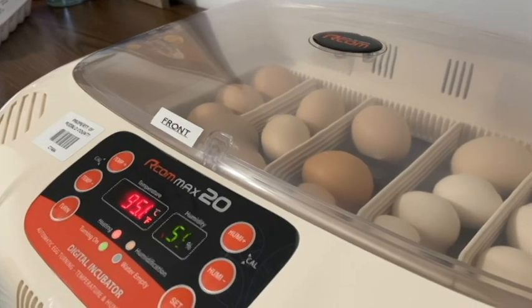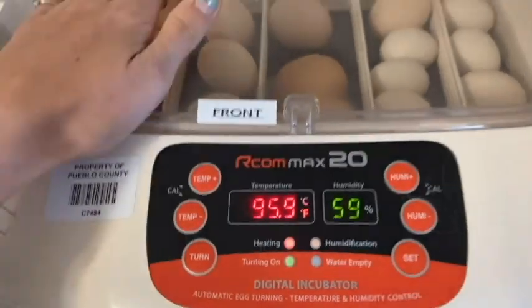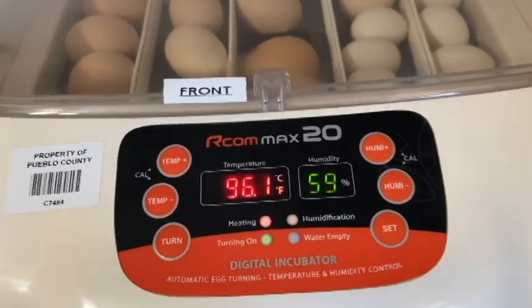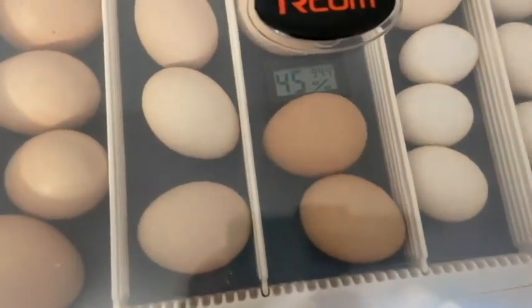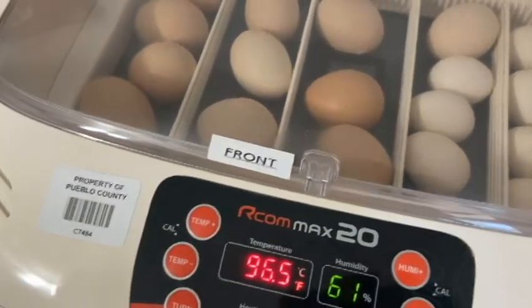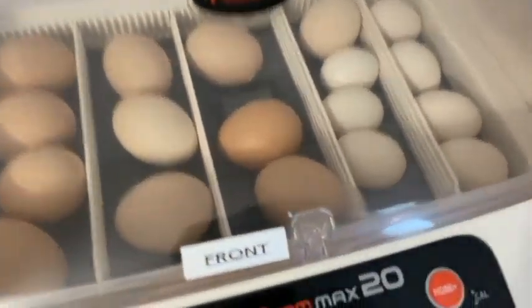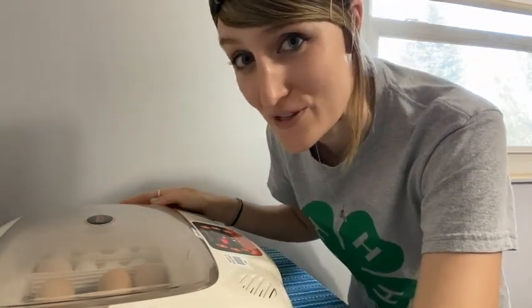There we go — the turning function is on. As you can see, our temperature is a little bit low and our humidity is just a little bit low, but that's because I opened the lid and some of that humidity and heat escapes. But it should come right back up. We also have another little gauge inside for a bit more info on temperature and humidity. Also, a very special thank you to the Rafferty family — they have the chickens that supplied these eggs for us.